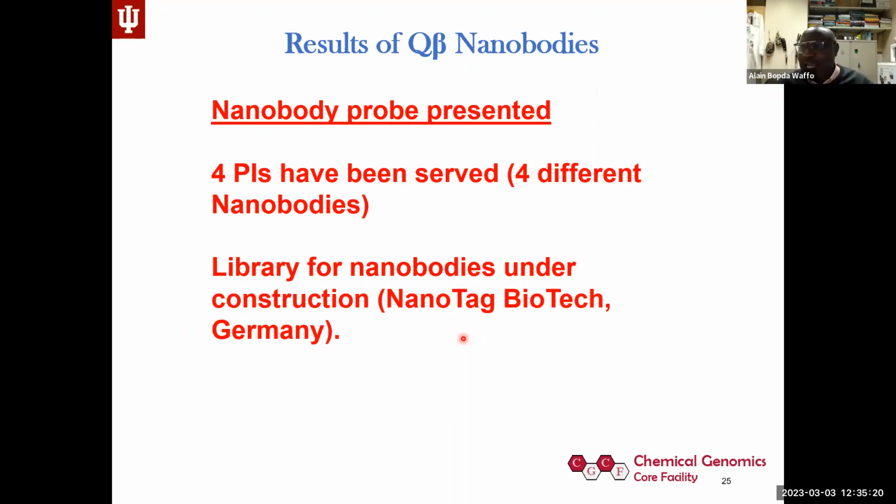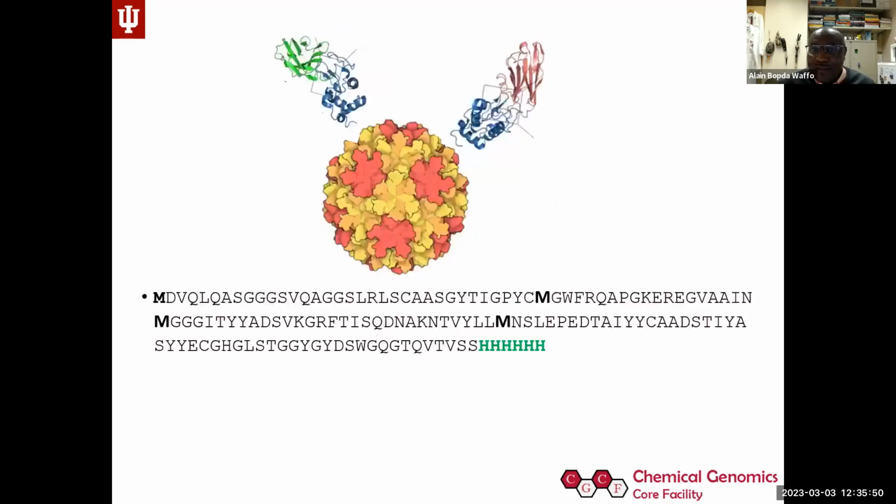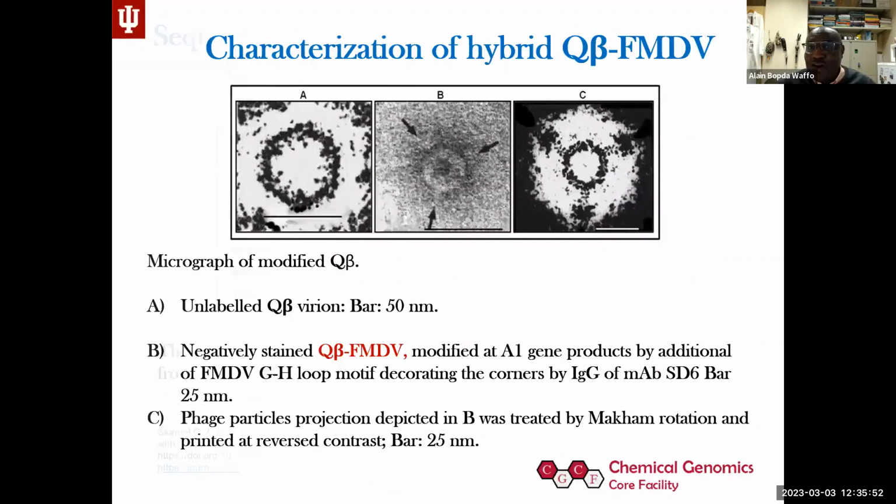Just to give you an idea, this can be done for any intracellular contact between protein and protein. We can narrow down to the key one, or we can present the wild type and you study your binding affinity, and then later we can come and see what are the major amino acids. So please feel free if you have something in mind. And like I said, not just the first list that I provided, there can be more than that.